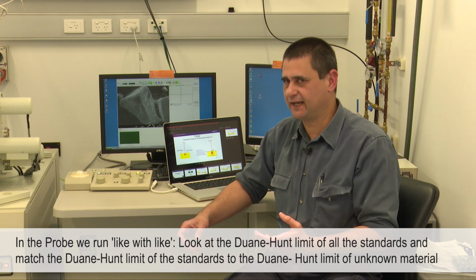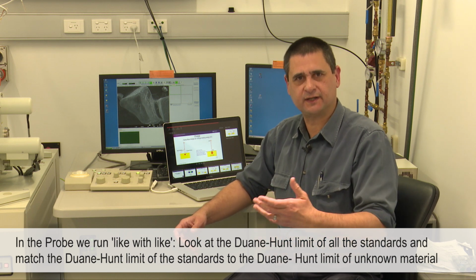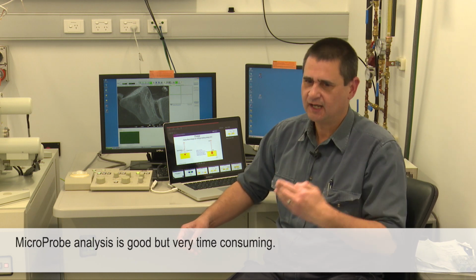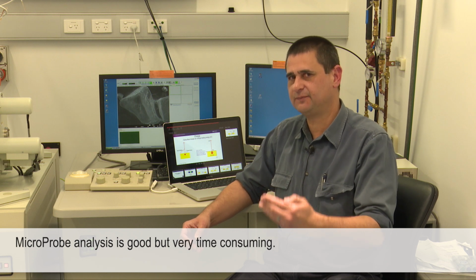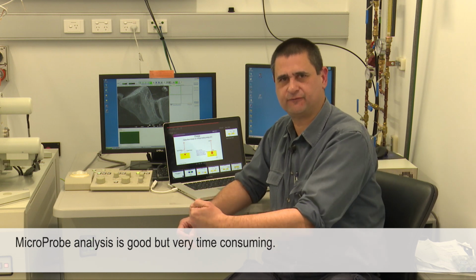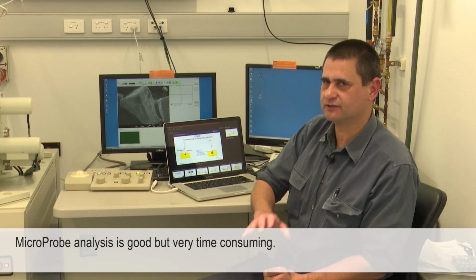It might take me a day or two to investigate all my standards to find out which one is the best one to use. That's why microprobe analysis is so good, but why microprobe analysis is so difficult. You may literally spend days working out how to correctly perform the analysis. Microprobe is the next level up. We won't spend much time on it.